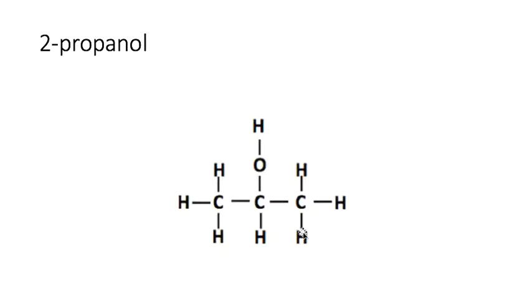We have these 3 hydrogens and these 3 hydrogens, and they're equivalent. They are exactly the same. So they're all going to show up as 1 peak, these 3 and these 3. So 6 of the 8 hydrogens would be showing up as the one peak, which was at about 1.0 ppm. And it's a doublet because this hydrogen right here can be up, which would lead to one peak for these guys, or it could be down spin, which would lead to the other peak for these guys.